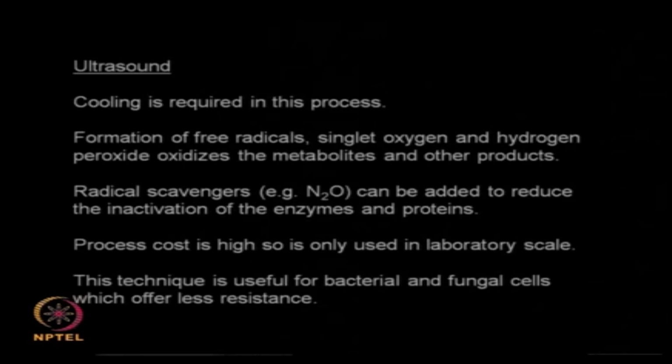The process cost is high in ultrasound treatment, so generally it is used in laboratory scale applications and not in full scale industrial production. In small scale applications, in labs, if you are performing a fermentation and you are interested in recovering some intracellular products, ultrasound is a very good treatment.